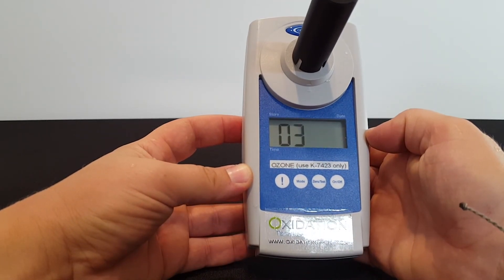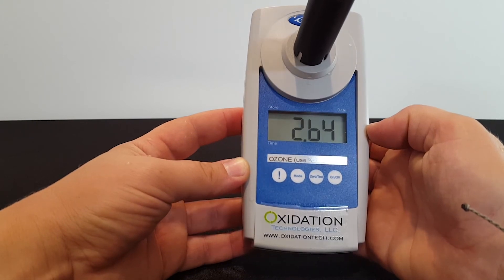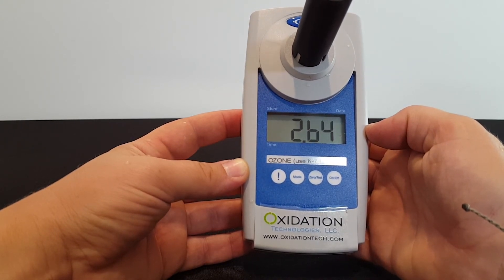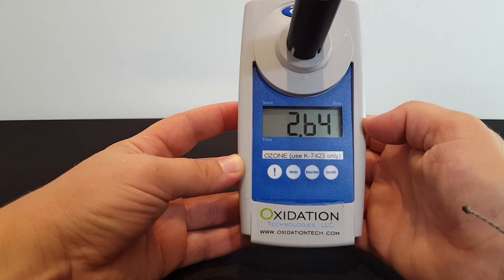The O3 symbol will flash for about three seconds, and then the reading will appear. In our test we have 2.64 ppm dissolved ozone in our sample.